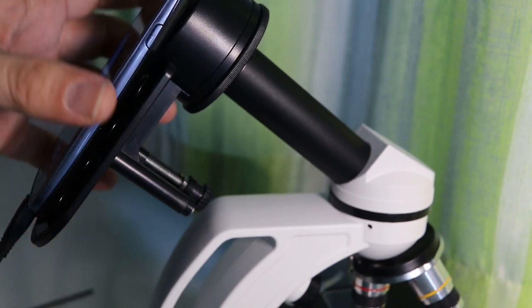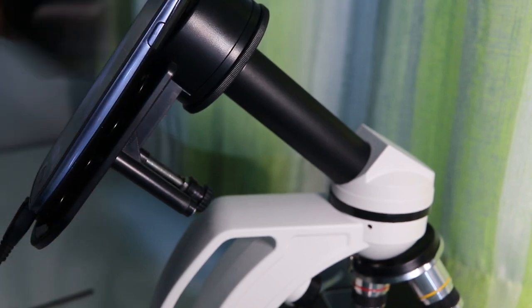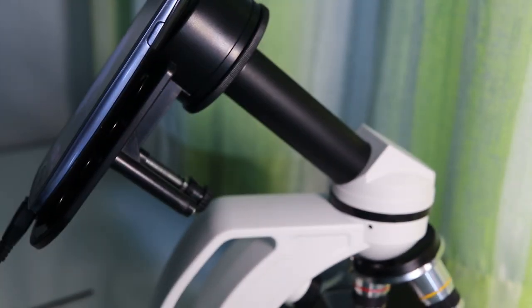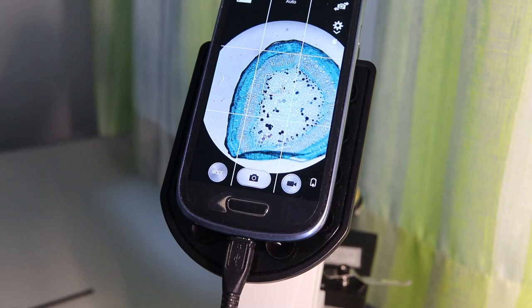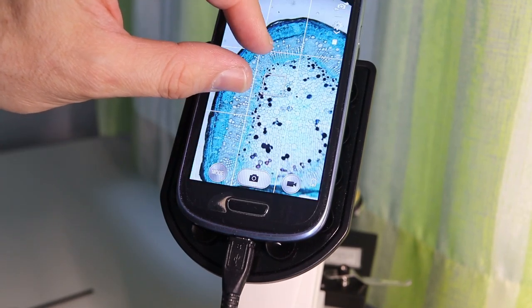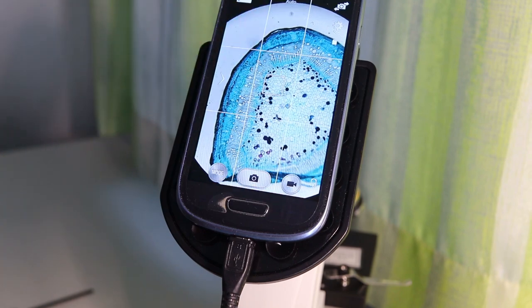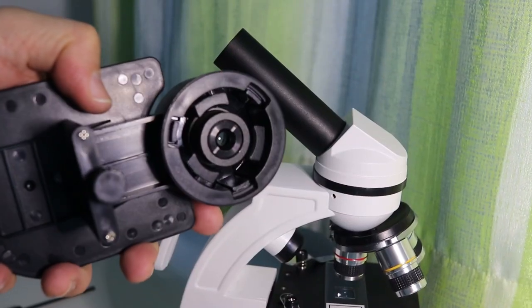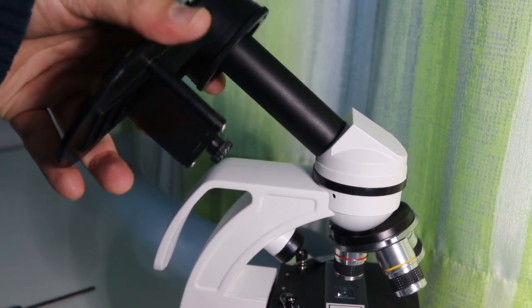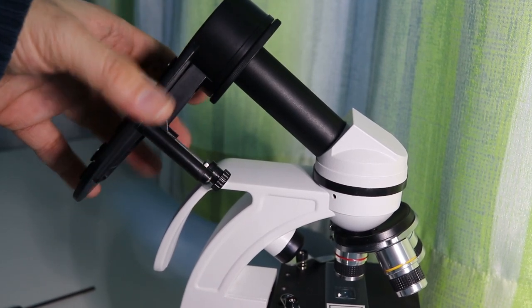What I have done next is the following. I have now exchanged the eyepiece with another eyepiece that I had, a slightly better eyepiece. And this is basically how it should be. I get a much larger field of view. I can still zoom in. The image quality is significantly better. And with a 25 times eyepiece, I'm also not getting a full field of view. They generally have a smaller eye relief anyway.